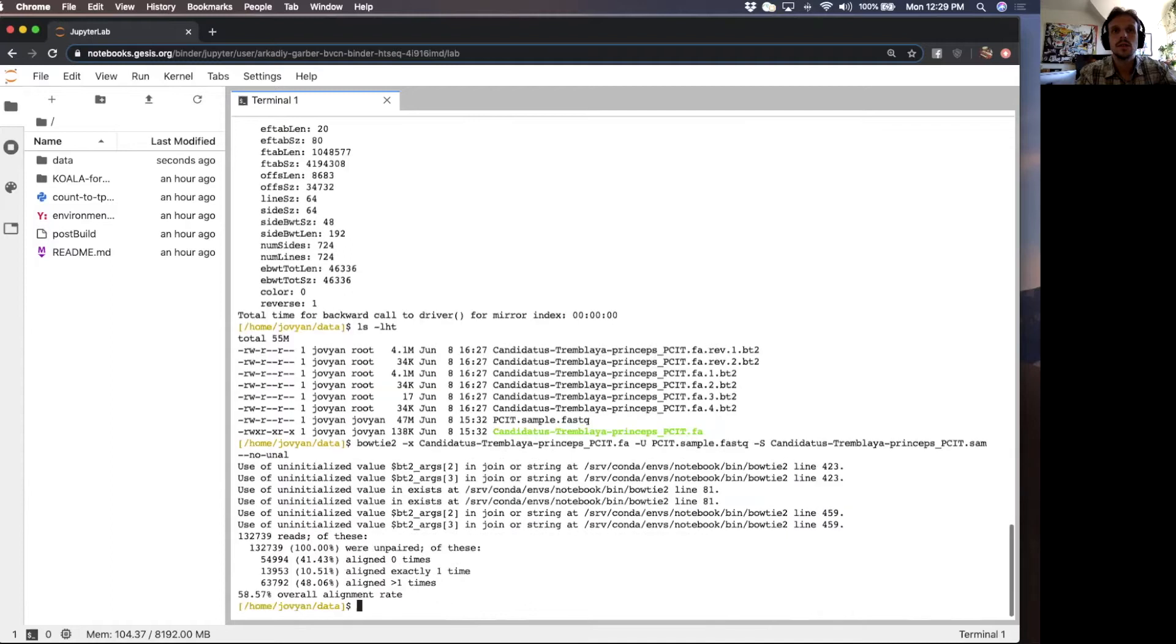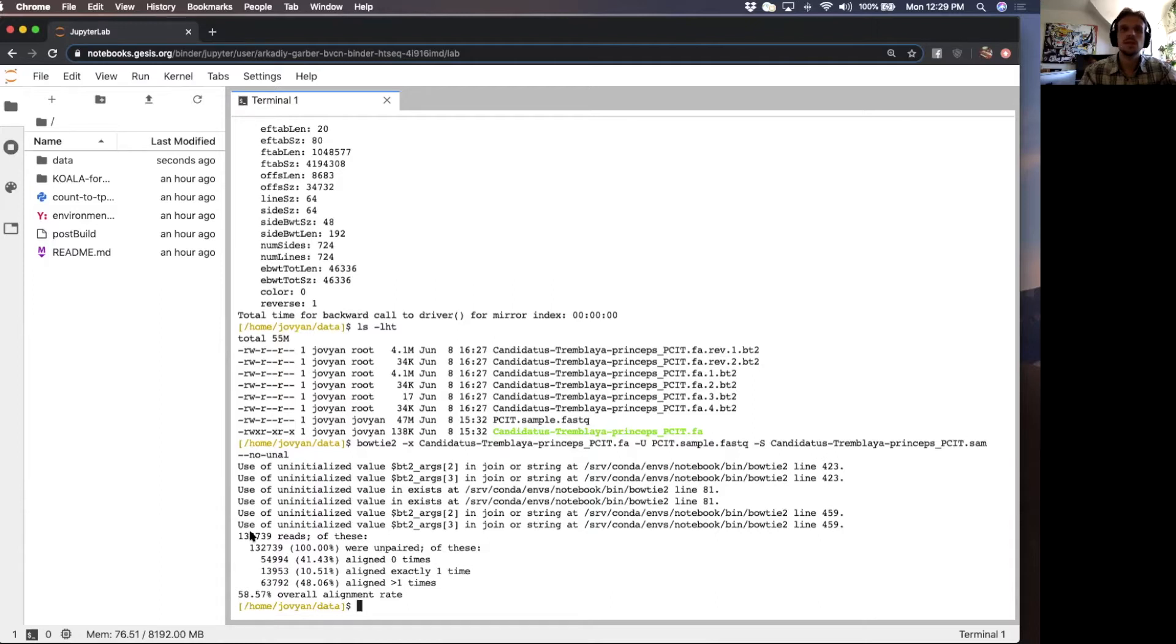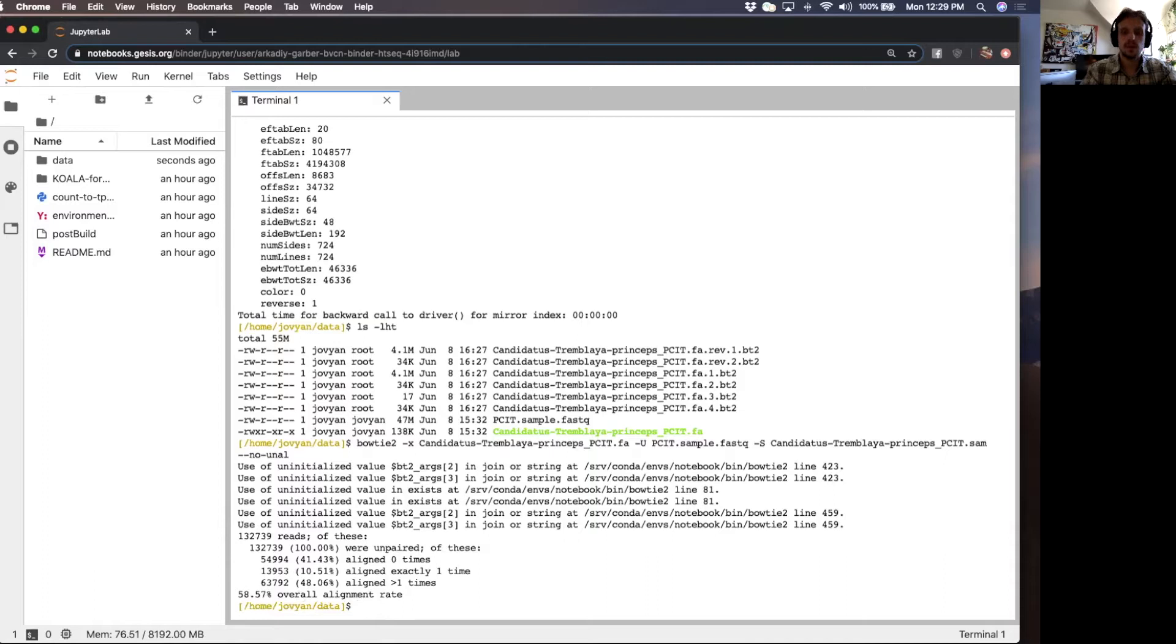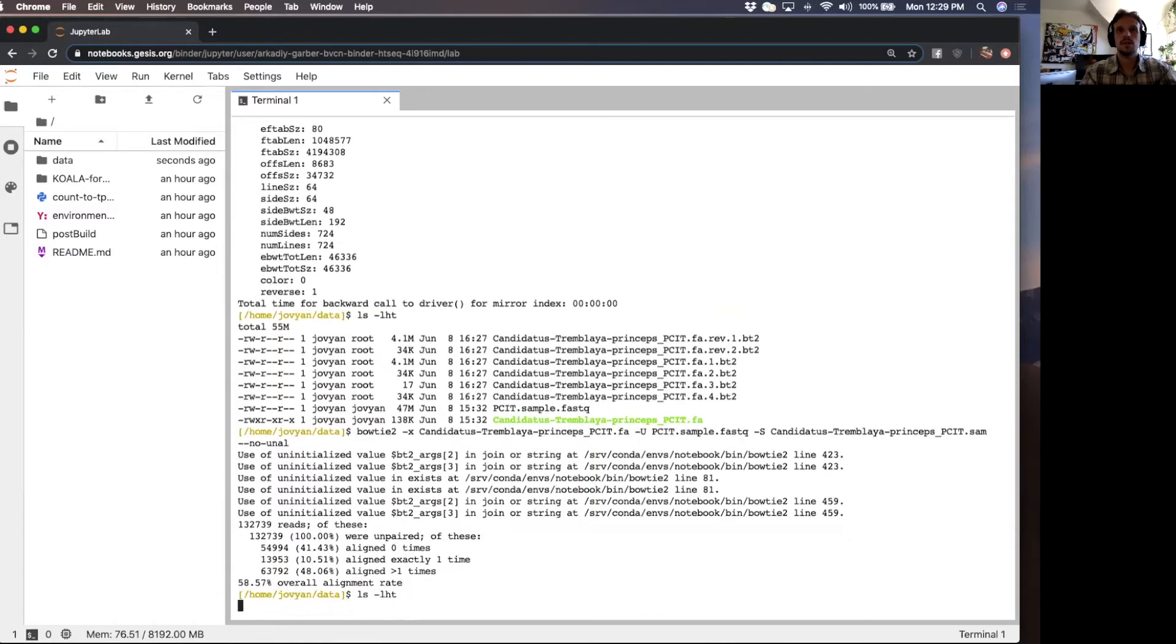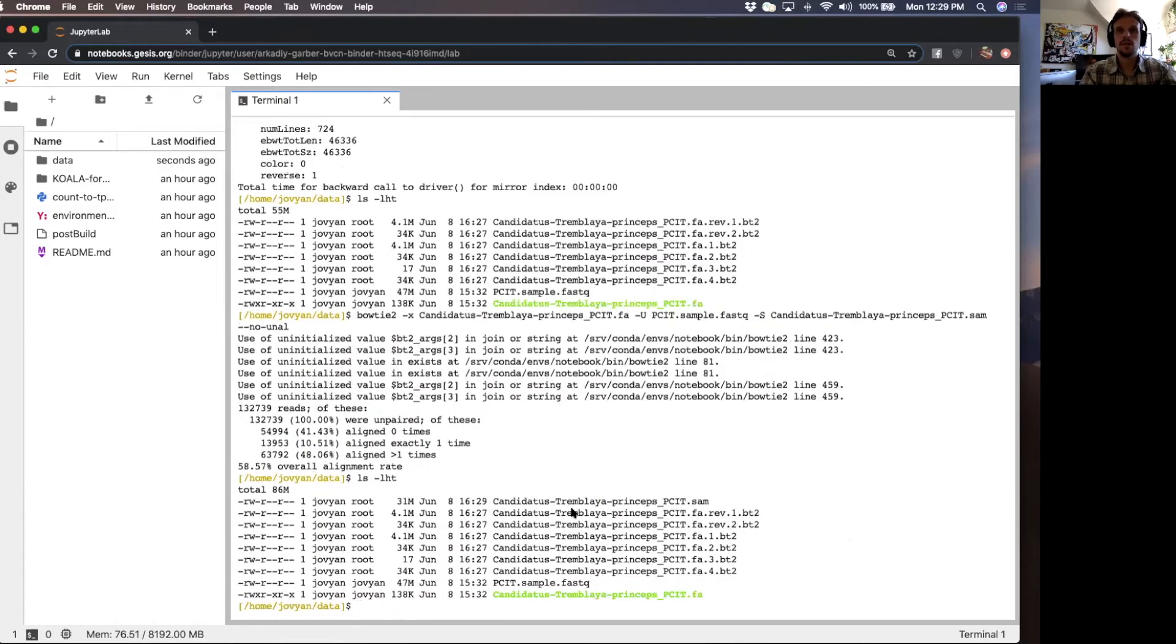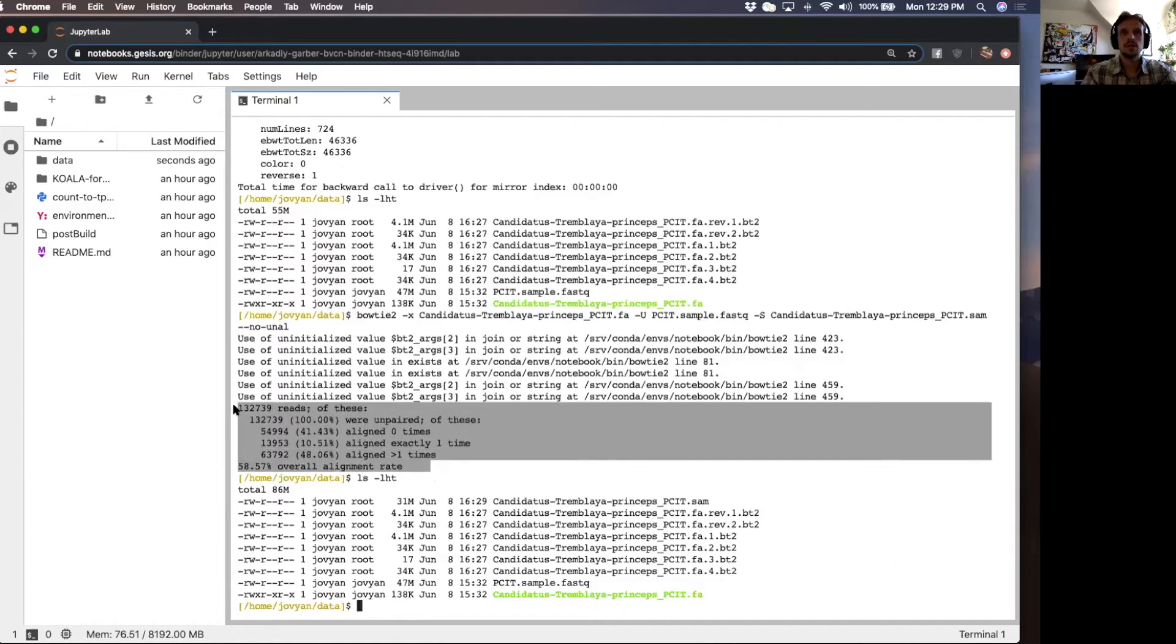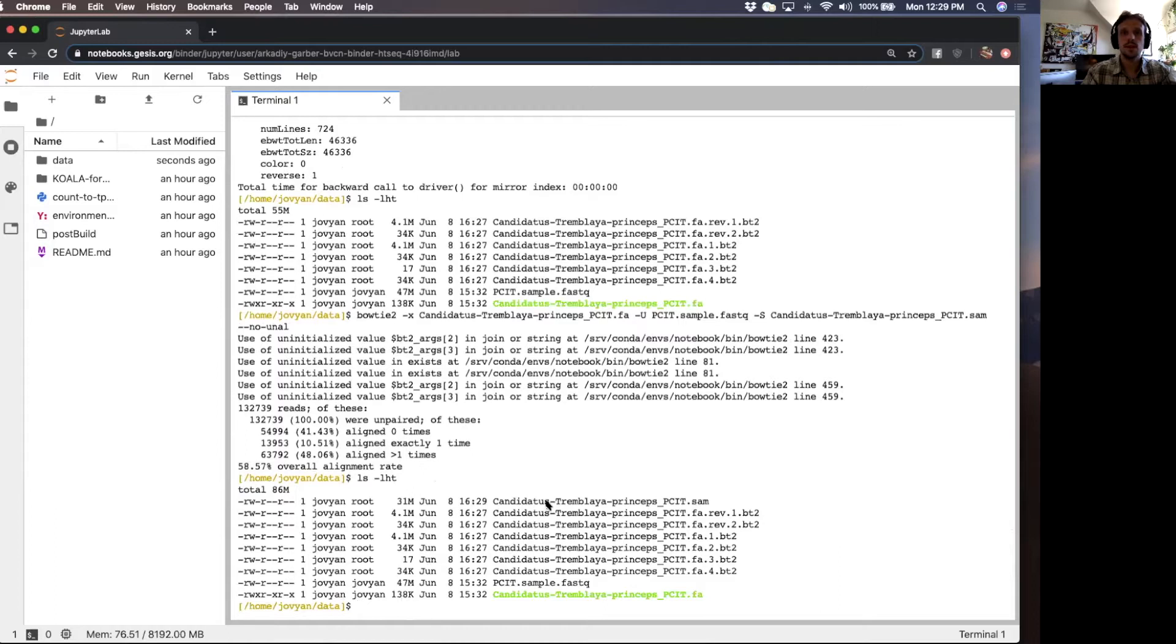Use of an uninitialized. I really don't know what this is. I haven't seen this before. But it looks like Bowtie finished successfully based on the overall alignment rate, which looks right. So we have the sequence alignment map here. Everything finished successfully. We have our overall alignment rate. You can save this. This is good data here.